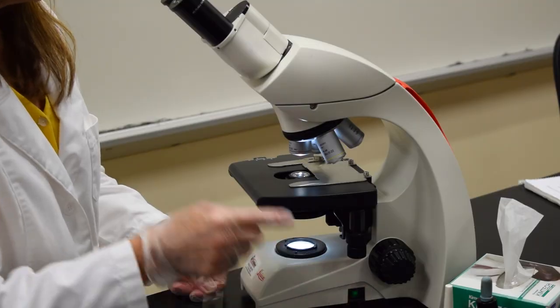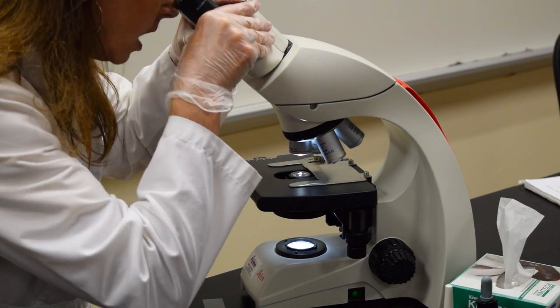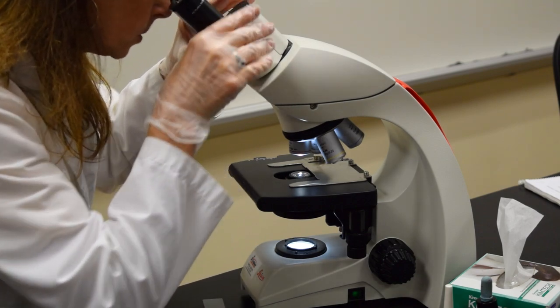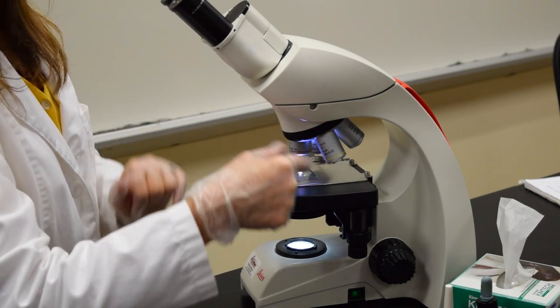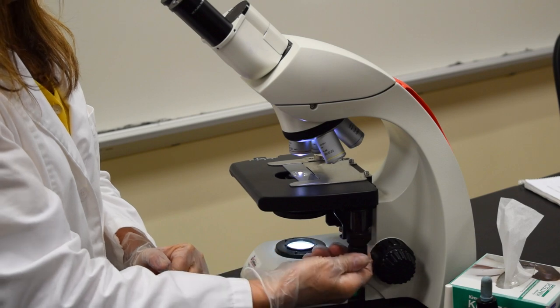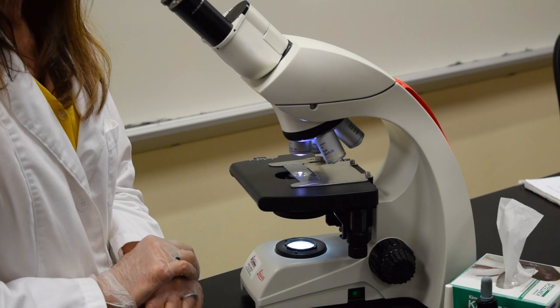Turn on your microscope. The scanning power is in place. I'm going to adjust the eyepiece to accommodate the distance between my eyes. I'm going to position the slide in between the stage arms and move the slide until the colored stain is right below the objective.